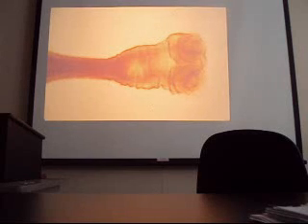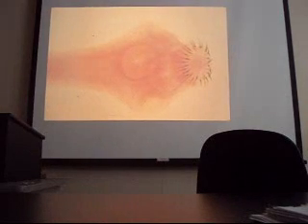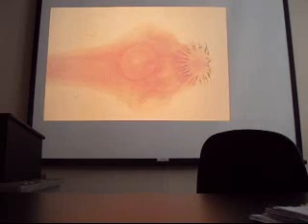Saginata. Saginata, because pork is armed and pork is solium, so pork has an O. Solium has an O. The rostellum is armed, and oh, that hurts. So there you go. There it is. That is solium, hooked with suckers.